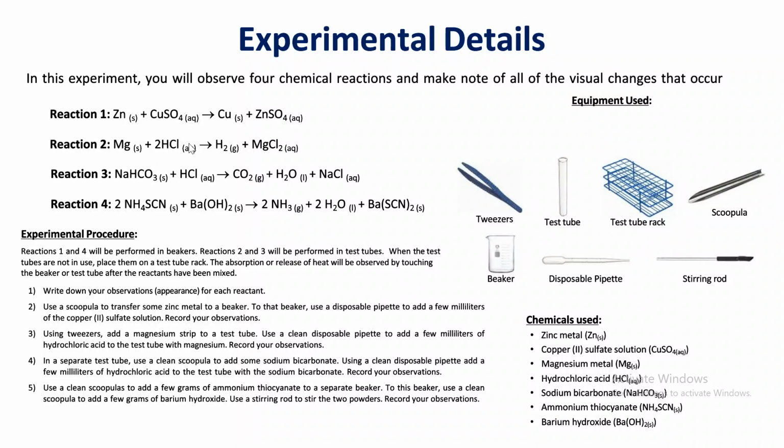We got two reactants on the left, two products on the right. The third reaction, in a separate test tube, we're going to use a spatula to add some sodium bicarbonate, NaHCO3, that will be our reactant.